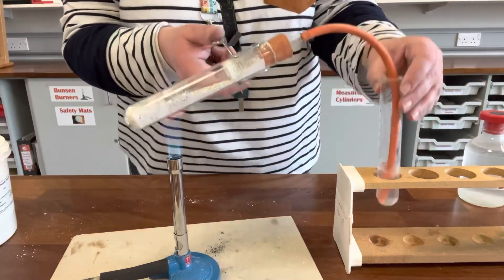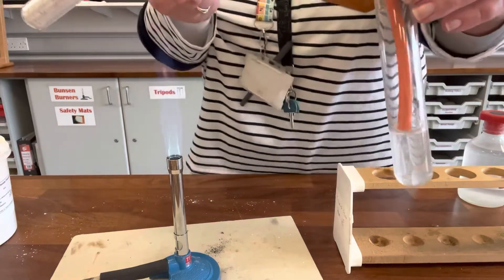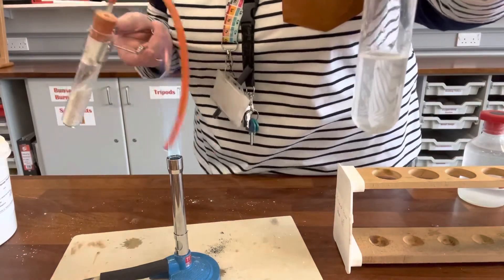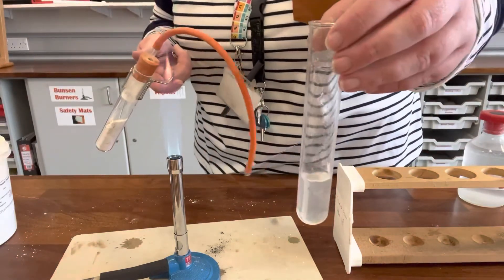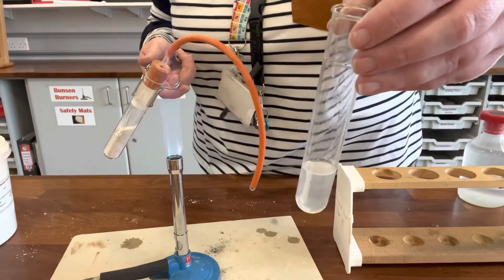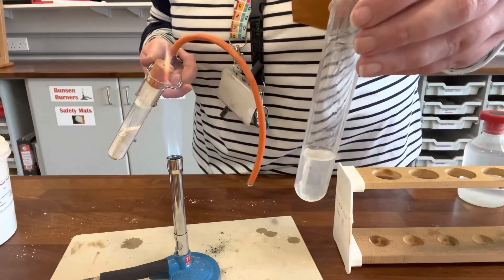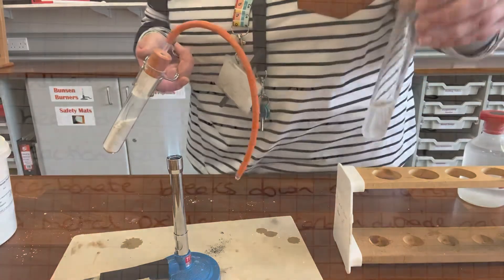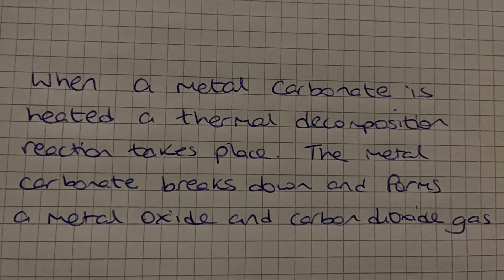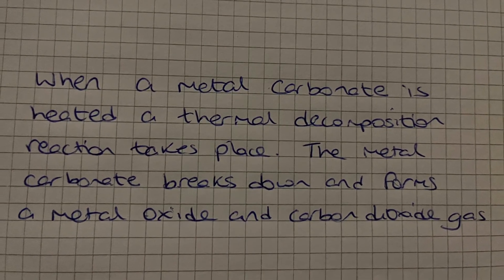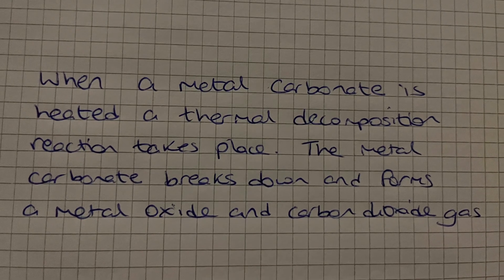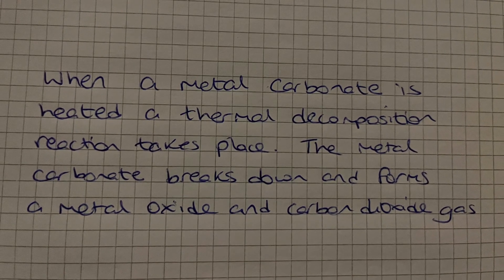You can notice on the screen that the lime water has turned cloudy, which proves that carbon dioxide is produced when calcium carbonate decomposes. To summarise: a metal carbonate will decompose when heated and will produce a metal oxide and carbon dioxide gas.